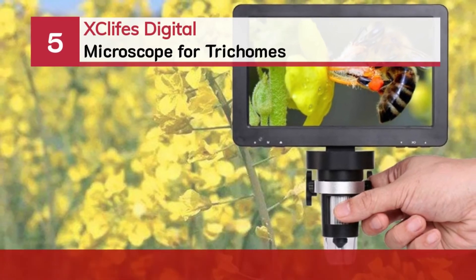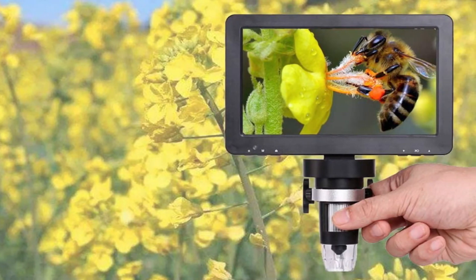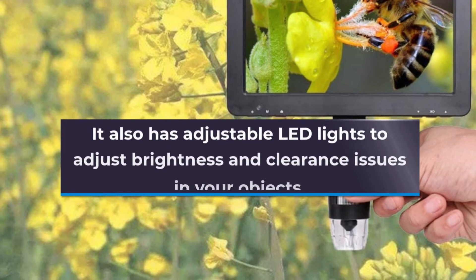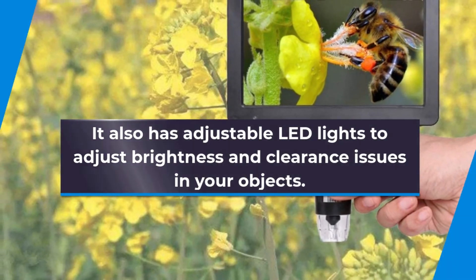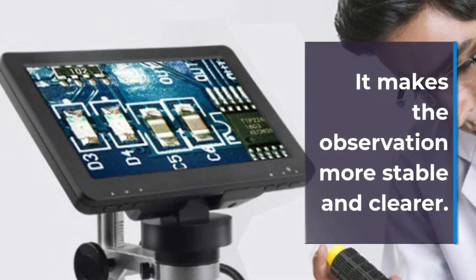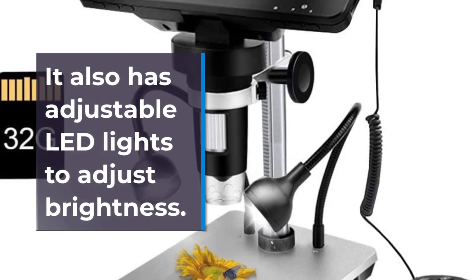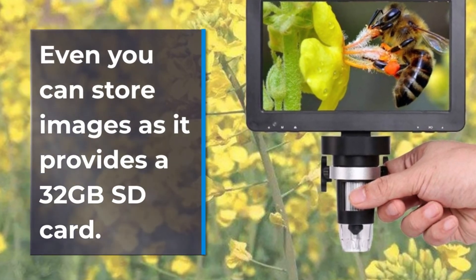Number 5: Xcliff's Digital Microscope for Trichomes. It has adjustable LED lights to adjust brightness and clearance issues in your objects. It helps assure fine details and clarity, making observation more stable and clearer. You can connect it with the help of a USB cord. You can also store images as it provides a 32GB SD card.